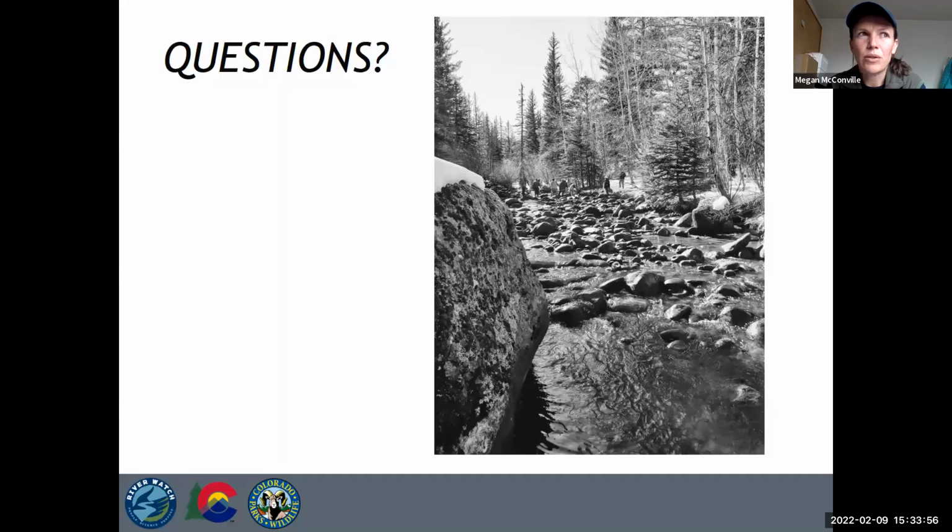One of the differences in what we've been trying to do critically with Riverwatch data is when lead is not detected in your sample, it doesn't mean that it's not present. So your reporting may show 0, but 0 is never really 0. It's just the ability of our detector to quantify what may or may not be present. So the biggest change that I anticipate is we have been really confident in analyzing a higher portion of concentrations. What we will do with the mass spec is basically increase that lower end of our spectrum.